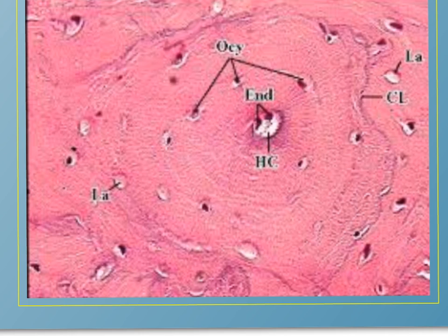These are the concentric layers of the osteocytes inside their lacunae, and in between we have the lamellae formed of calcified collagen fibers. Here we have the lacuna, and this is the osteocyte inside the lacuna, and here we have the calcified collagen fibers, and this is also the space where the osteocyte is present.